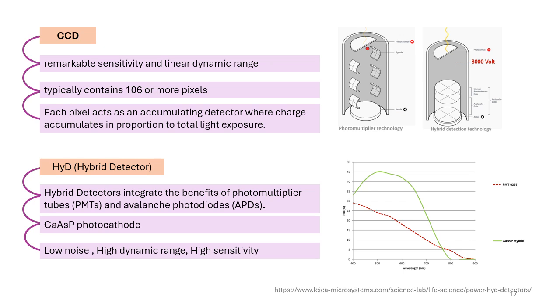So nowadays CCD is not only used in microscopy, but also in various kinds of instruments. Like we know that it is also used in cameras, and it's a very useful and very efficient detector. So nowadays it has a very wide usage.